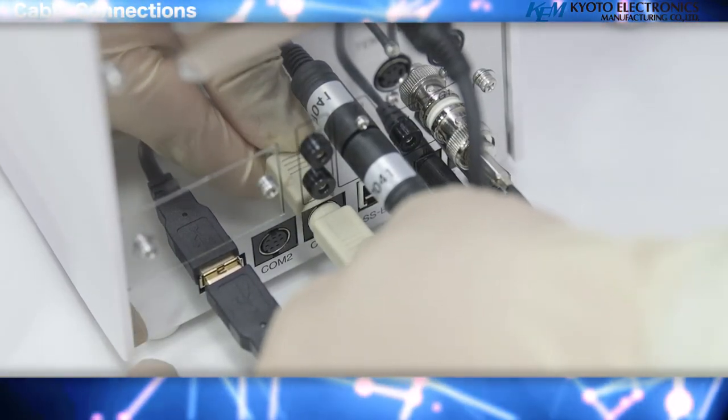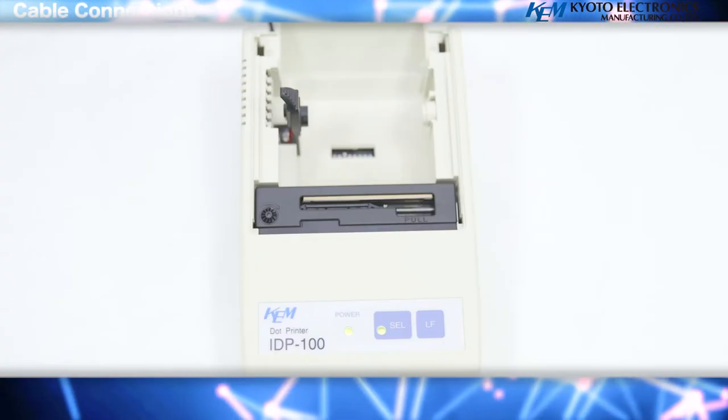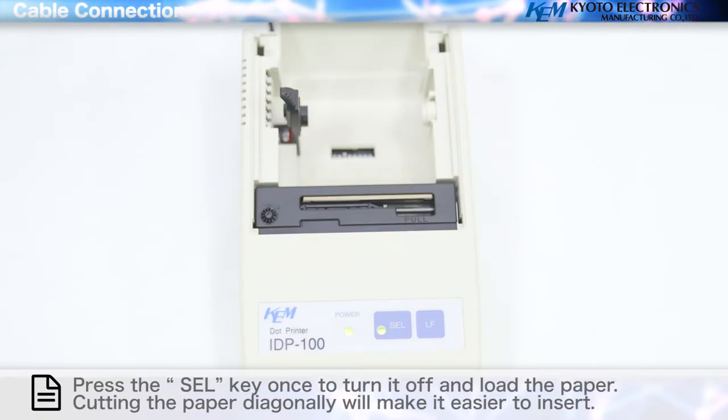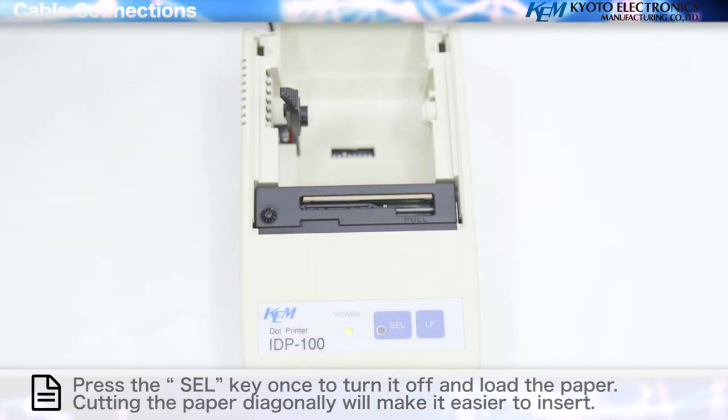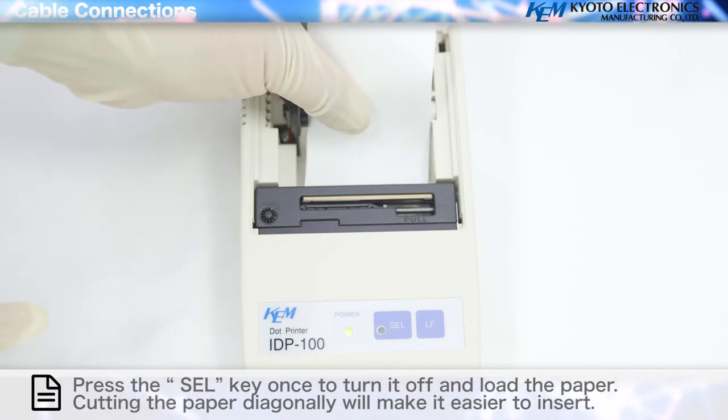Connecting the printer: you can print titration results and method parameters by connecting a printer. Press the SEL key once to turn it off and load the paper. Cutting the paper diagonally will make it easier to insert.